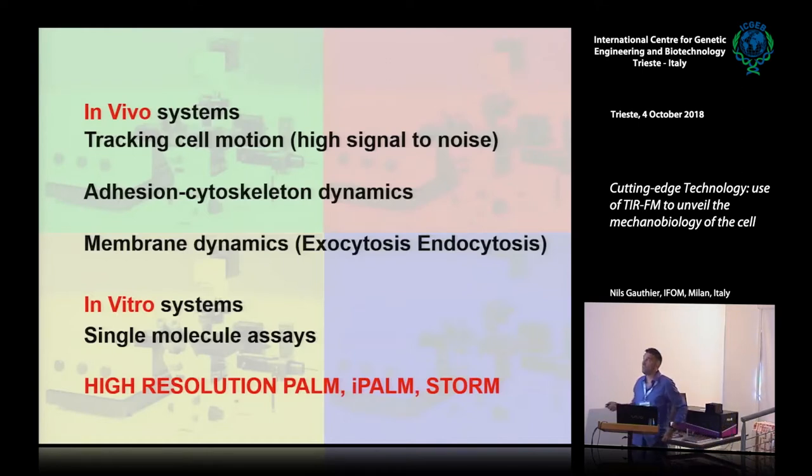But it's also very used in in vitro systems. You can do many single molecule assays, and it's also the base of high resolution PALM, iPALM, and STORM. And what I would say with that, why? Because TIR-FM microscopy allows all these techniques, and there is no system that gives you a better signal to noise ratio today.